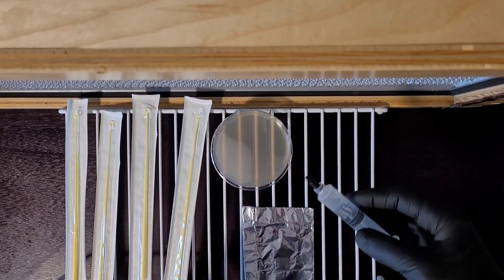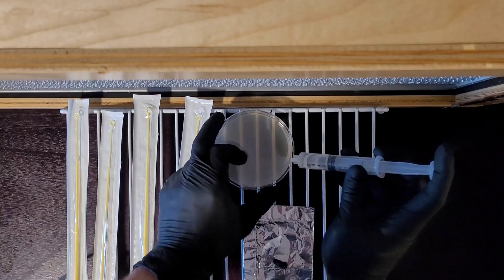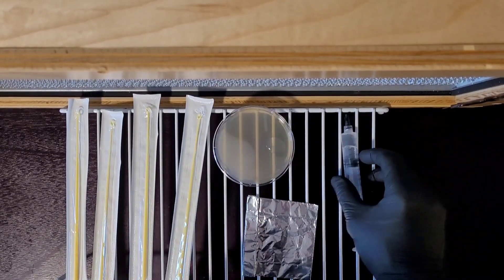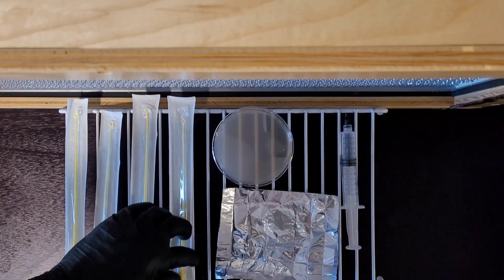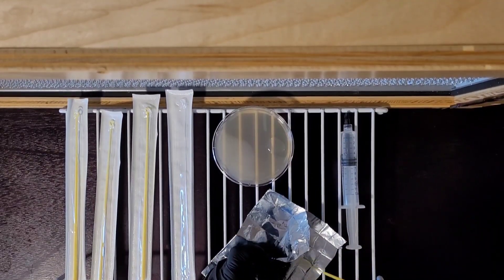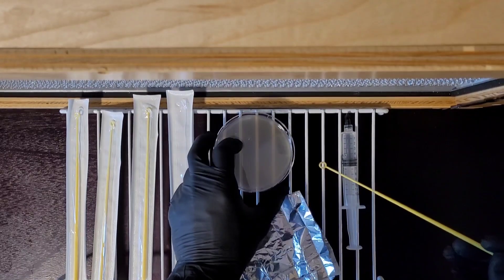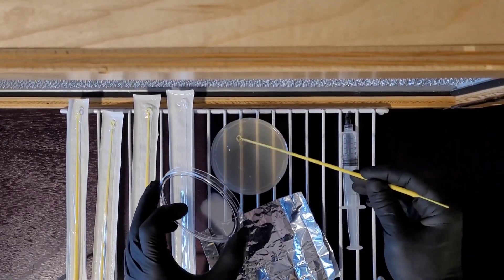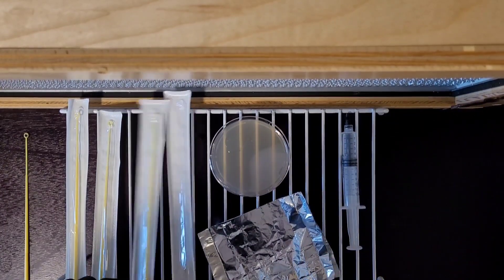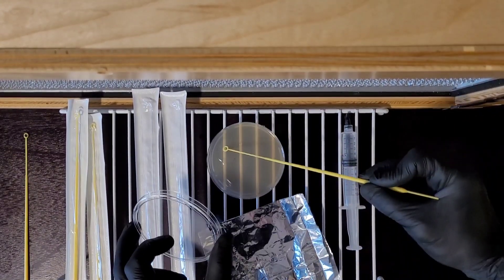Once your liquid is cooled down, all you need to do is add a drop to the edge of the plate — it's a little bit more than a drop, but that'll be fine. Open up your dry spore print, use your inoculation loop to pick up some spores, and swirl it around in the liquid.